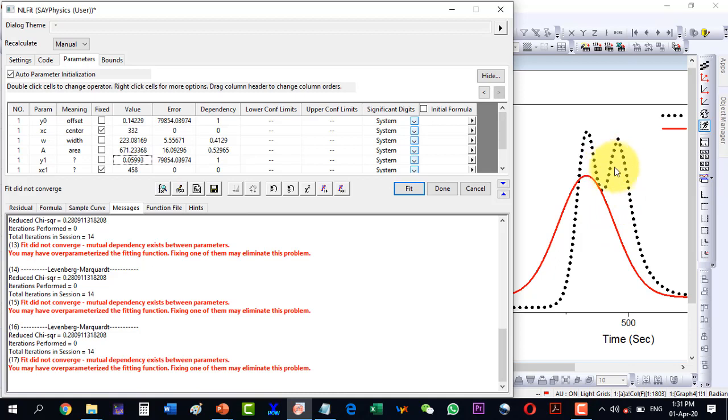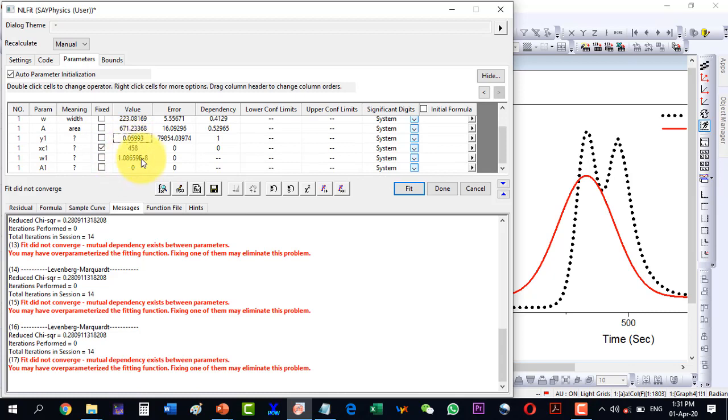So if I want for this one, then I can select another value, which will be less than this one, but not very less, like this point, 7 zeros and then 1. So I just fix this value, and I take this value, let's say around 100.